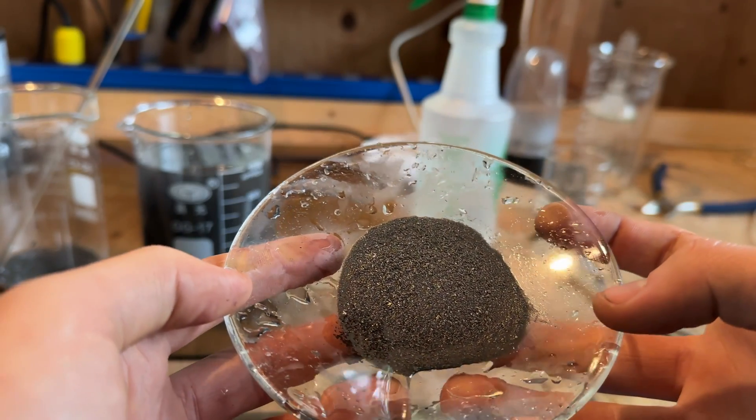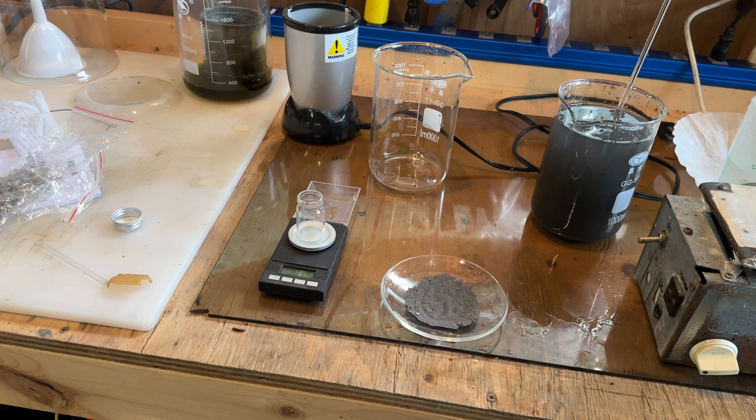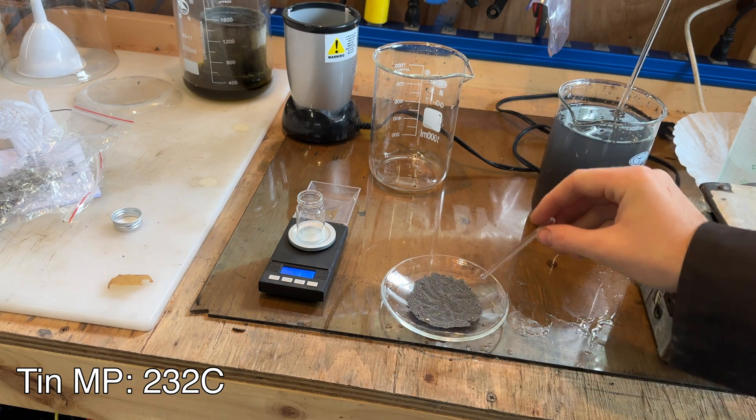The tin was then added to a watch glass and heated on a hot plate to drive off the water. To leave it as powdered tin, just heat the tin on low heat. If a single piece of tin is desired, the watch glass can be heated above 232 degrees Celsius to melt the tin together.